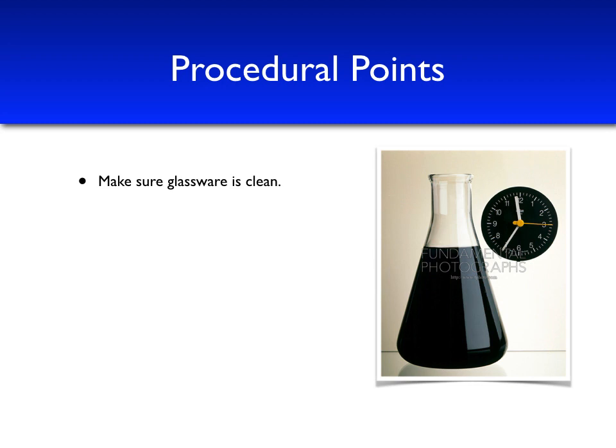First of all, it is very important that we keep all of the glassware clean. This is because, as you'll see in part 3, when you observe the effect of catalysts, we don't want the presence of other ions to interfere with the reaction itself. All glassware is scrupulously cleaned before running this experiment.